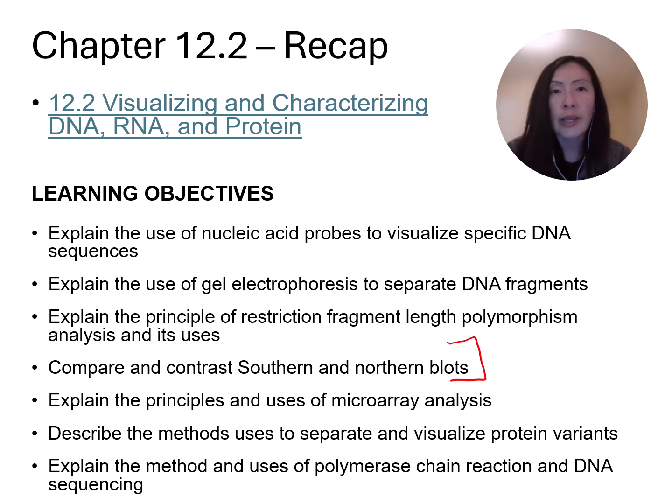So microarrays contain thousands of DNA probes attached to that tiny glass slide. Fluorescently labeled complementary DNA from samples will hybridize to these probes. And the color and brightness of each spot tells us which genes are active and to what degree they're active. So we use this to compare gene expression patterns between different conditions, such as healthy tissue versus diseased tissue.